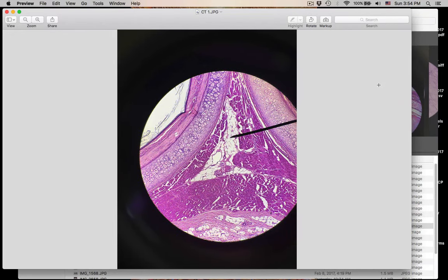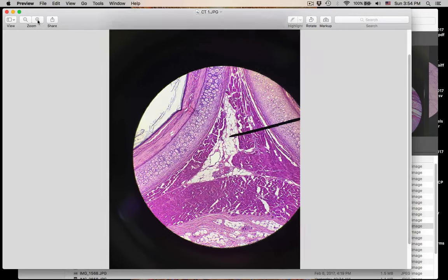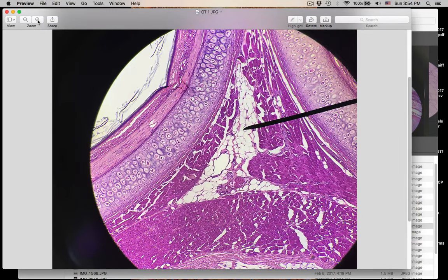With connective tissue, you're going to see lots of different types of tissue types. In this one, smack dab in the middle, what connective tissue are you identifying? That's number eleven, where the pointer is. What connective tissue is the pointer in? It's surrounded by other types of tissues too, but what are you seeing where that pointer is?